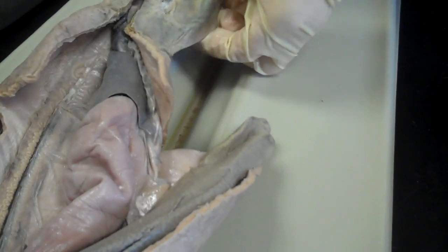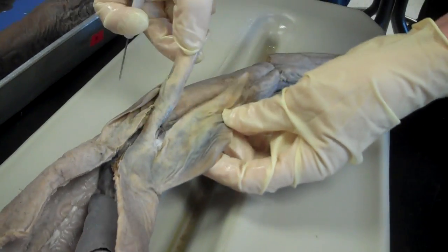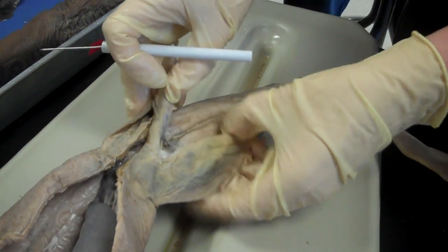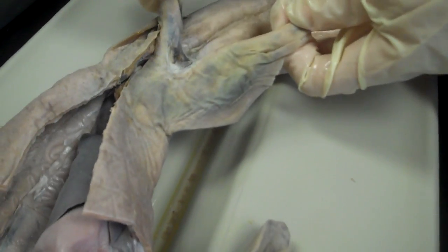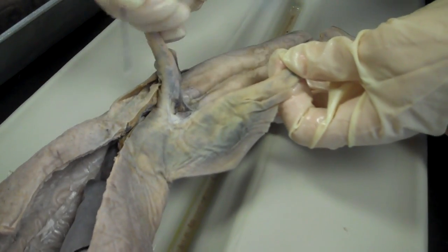Alright, so you can tell this is a male shark by the claspers here attached to the pelvic fins. This opening here is the cloaca. That is a common opening for the excretory system, reproductive system, and digestive system.